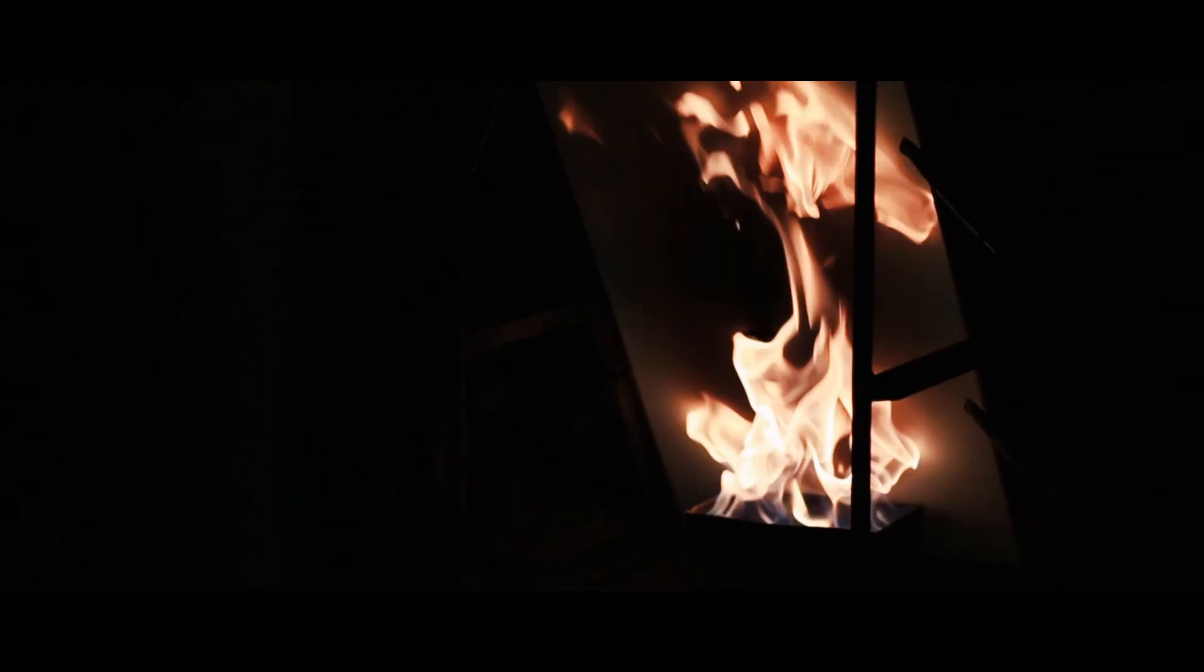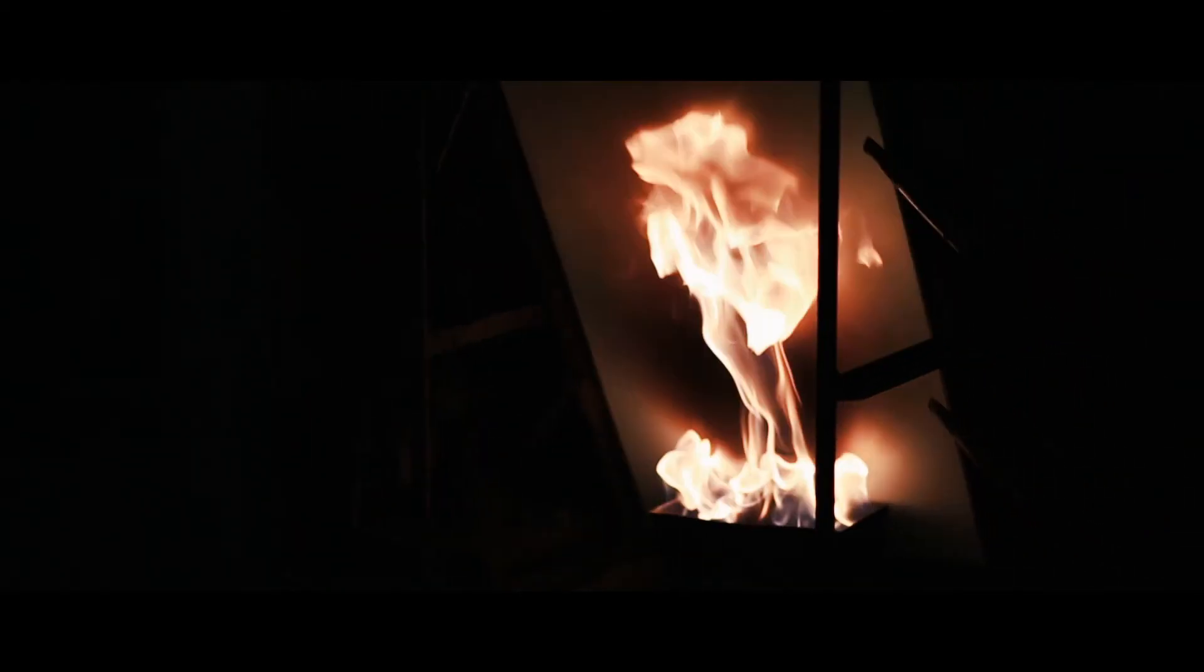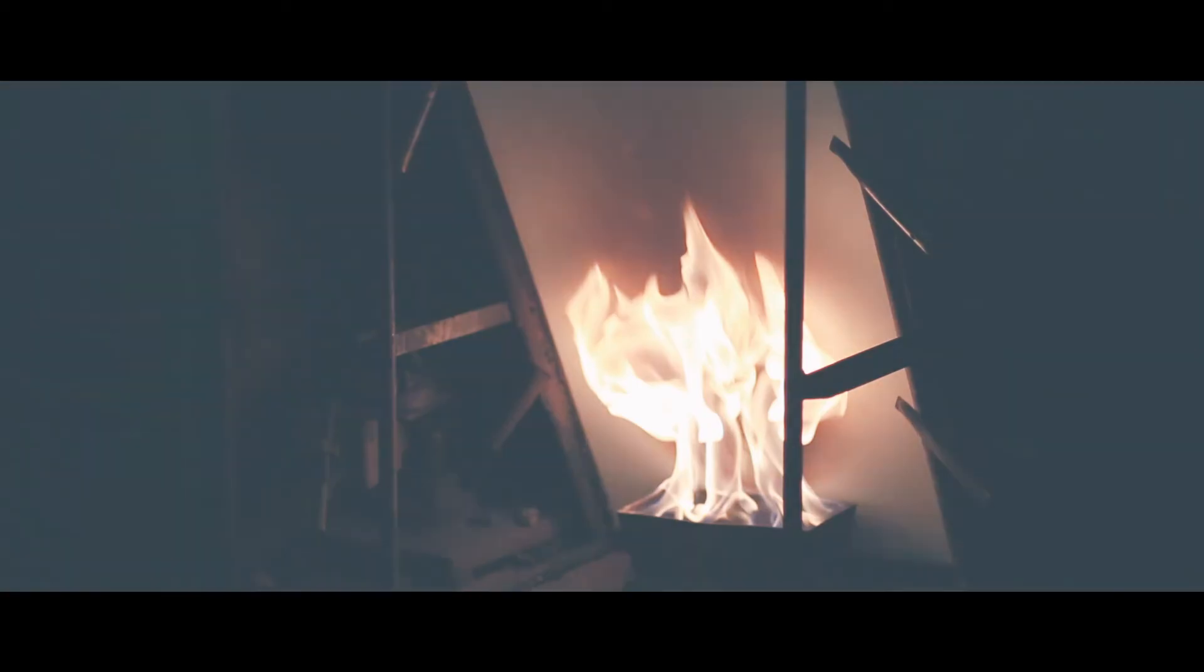The light beam is directed through the room towards a detector which is positioned on the opposite wall. As the smoke builds up in the room, the amount of light that reaches the detector decreases. During this test we will assess the smoke production during both the flaming and the smouldering phases of a fire.